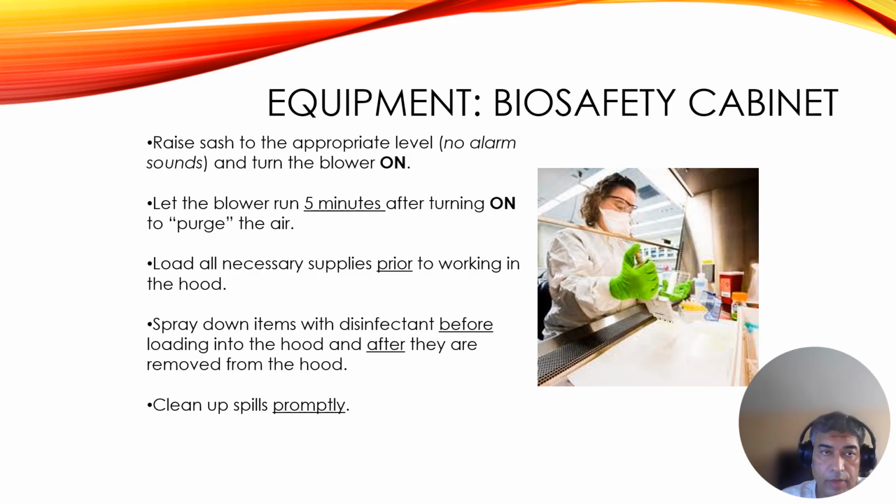When you lift the sash up, the blower turns on automatically. Let the blower run for 5 minutes after turning on to purge the air. Don't directly start your work or experiment, because you need to provide clean air.